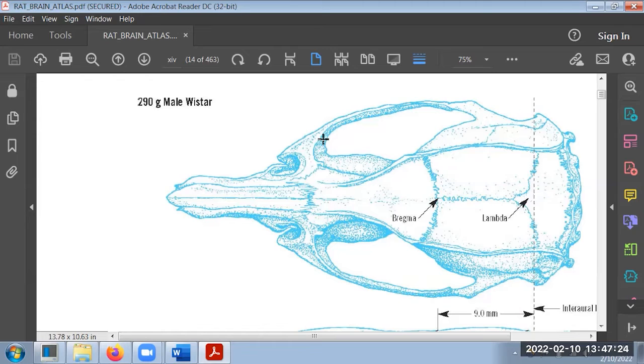So what I mean by this is that if we don't know where to start in surgery to target what we're going to find in the brain, then again, we're flying blind. We have to have some place that is zero, our starting point. One that a lot of researchers use is bregma. And so this bregma reference point is where the fissures of the fixed joints of the skull do this sort of crossover point, where it's either like an opened up Y shape, or sometimes you can see the fissure going forward from there.